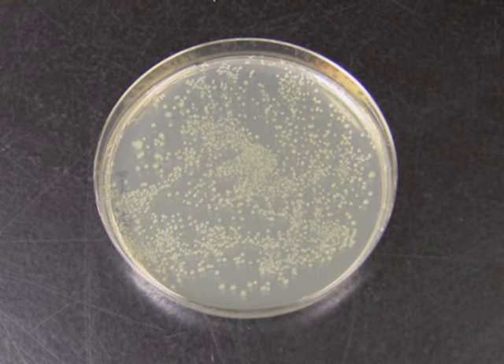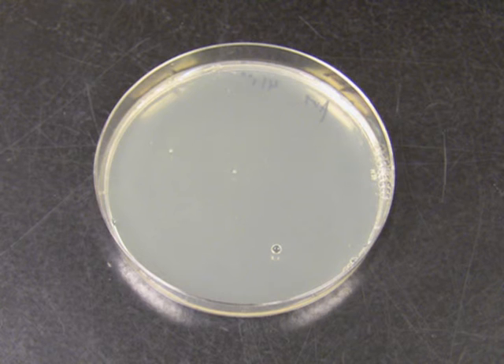Another reason for having no colonies on day 2 is low quality of plasmid DNA. An easy way to check the quality of plasmid DNA is to retransform 1 microliter into competent cells. If you get a carpet of colonies like this one on the plate, then your plasmid DNA is good. However, if you get only 10 or 20 colonies, it would indicate low quality plasmid DNA. In such a case, pick one of those colonies, prepare a fresh plasmid miniprep, and try to clone your insert into a fresh plasmid.